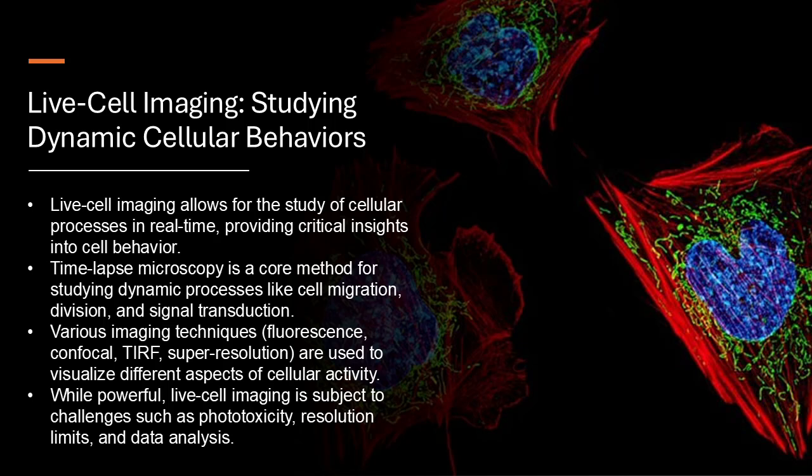We've all seen those amazing pictures of cells, the ones in textbooks. But can you imagine actually seeing them in action? Moving around, dividing, responding to their environment. It's incredible, like a whole hidden world coming to life. It really is, and it's all thanks to this revolution in microscopy. It's called live cell imaging.